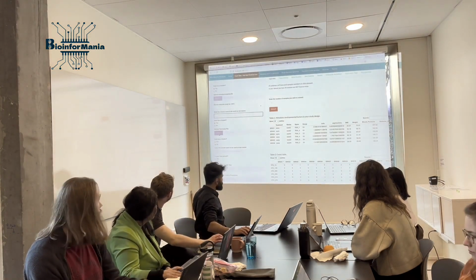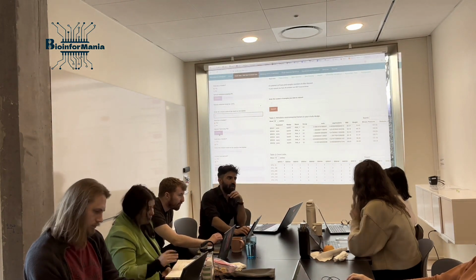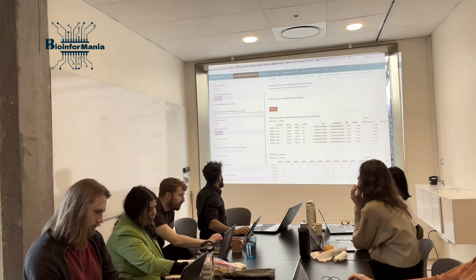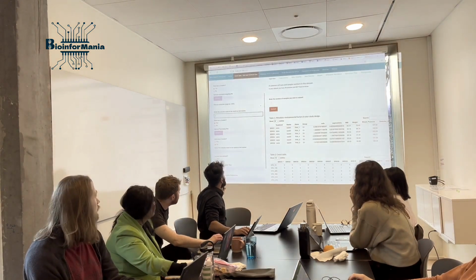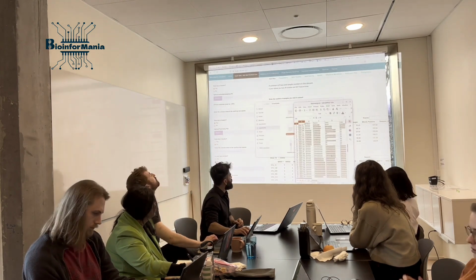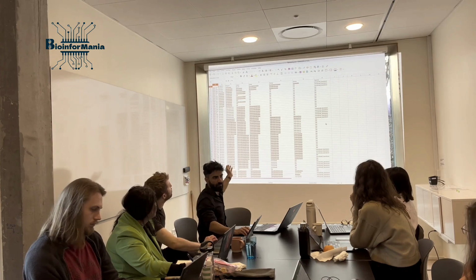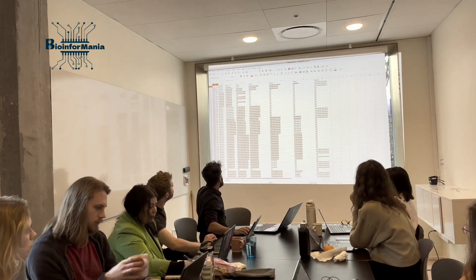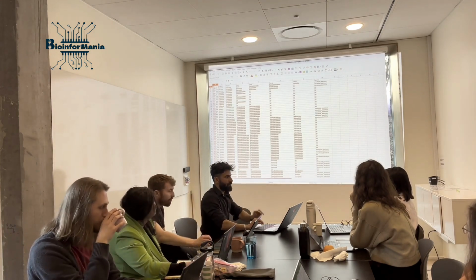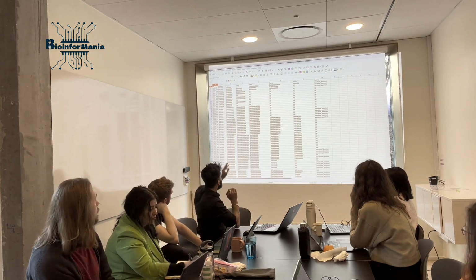Taxonomy table. There are two types of taxonomy data. One of them is parsed, one of them is non-parsed. Ours is parsed. This is a parsed, clean taxonomy table. Again, I give it a name here, ID or OTU or whatever, okay? Completely arbitrary. But this is parsed.